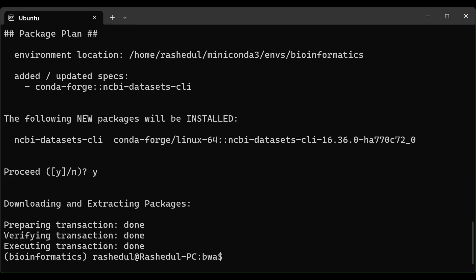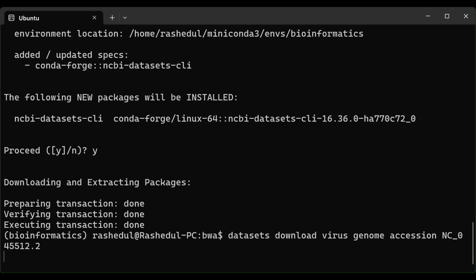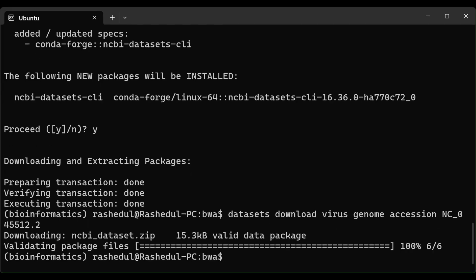We will use NCBI's CLI to download the data. This command starts with 'datasets download virus genome' and we can download by accession. This is the accession for the coronavirus genome, and using this command we can directly download it from NCBI. I'm pressing Enter — it may take some time depending on the file size. The download is finished.